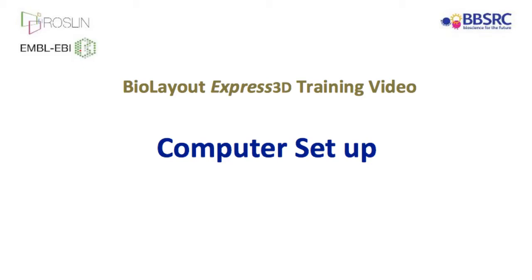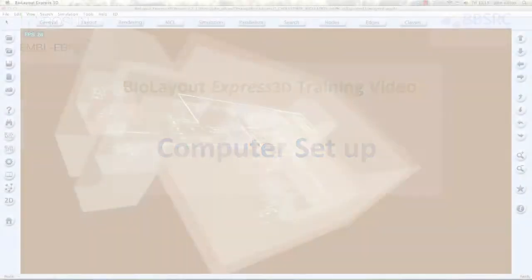Welcome to BioLayout Express 3D training video covering computer setup. This video is devoted to instructing users on the basic setup needed to run BioLayout Express 3D.